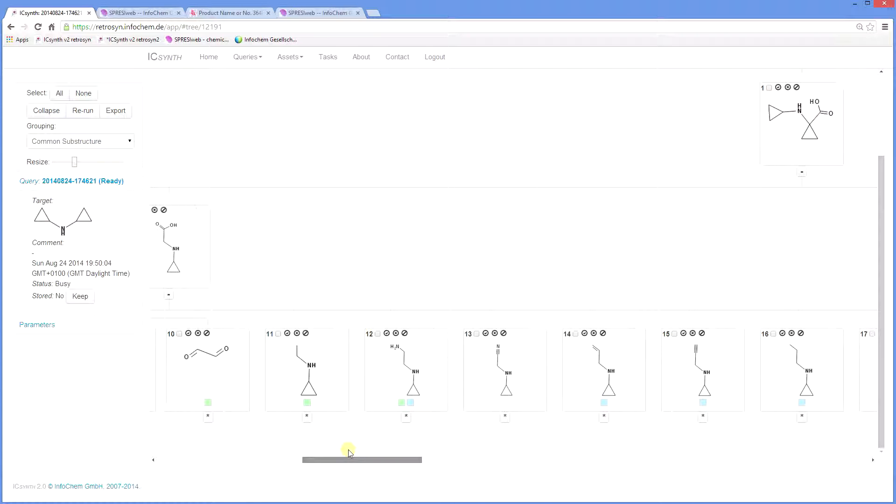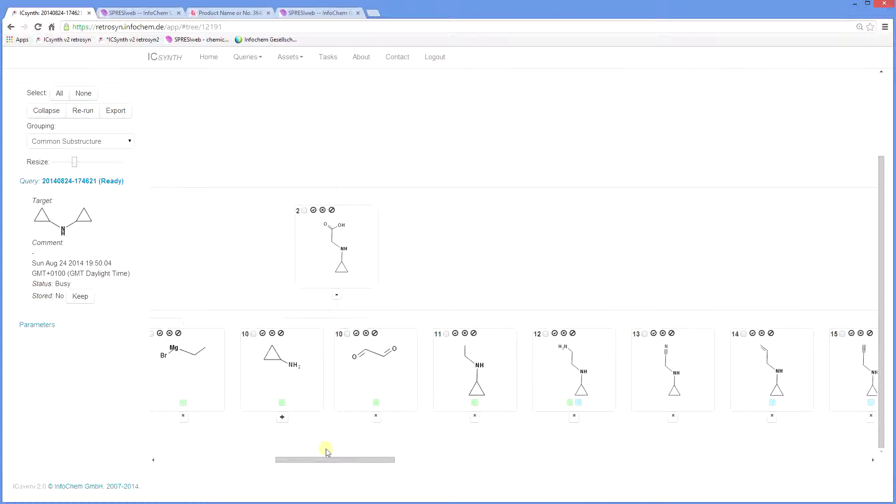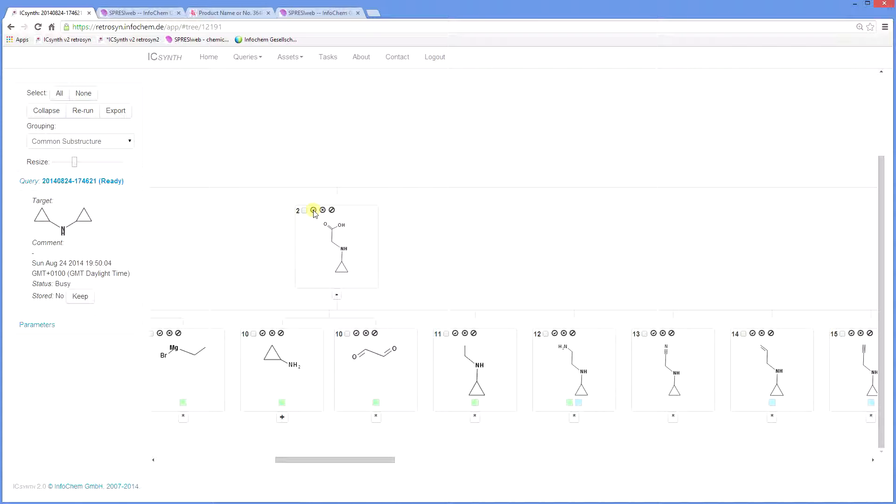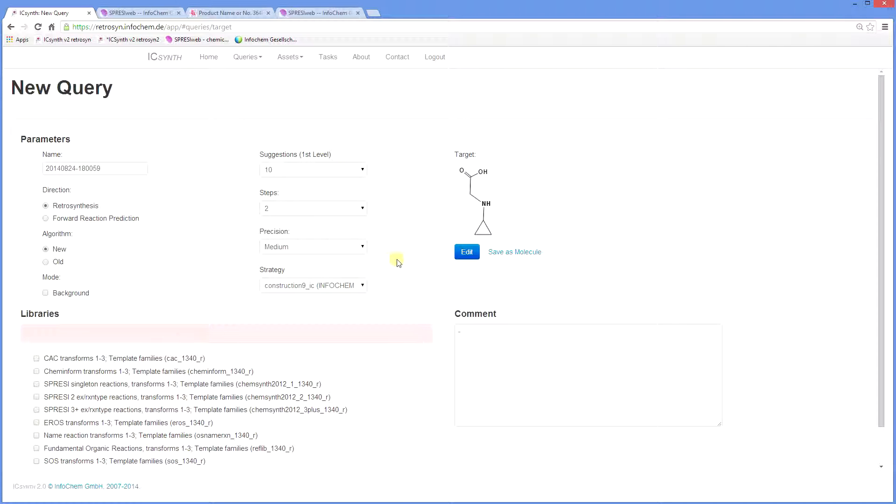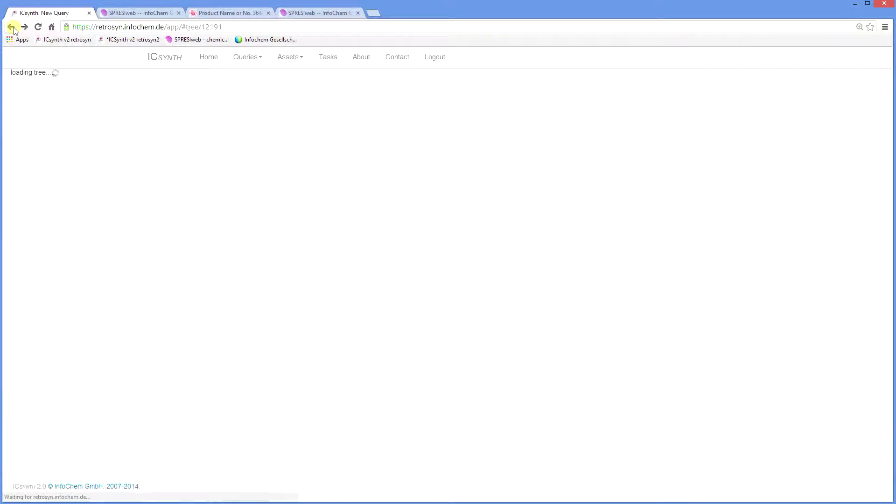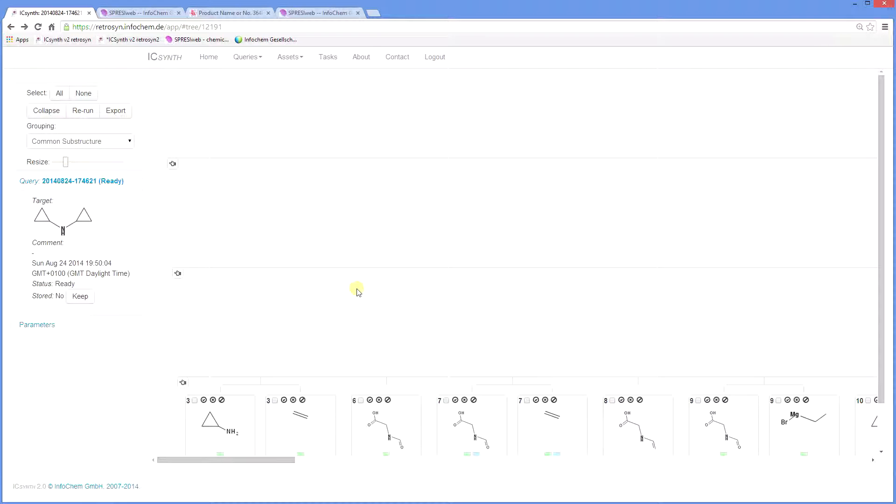To start a new retrosynthesis from any node on the tree, click on the tick next to the node and that structure will become the new target. You will return to the new query menu where you can repeat the same procedure with the same or different parameters and generate further steps back to your desired starting point.